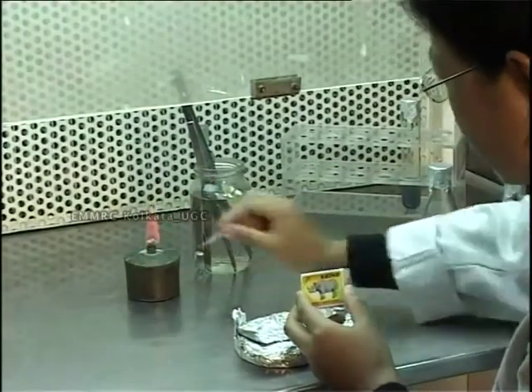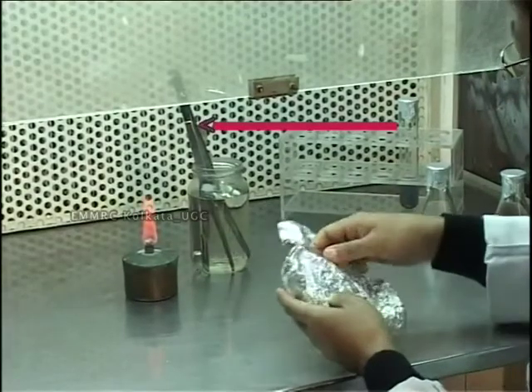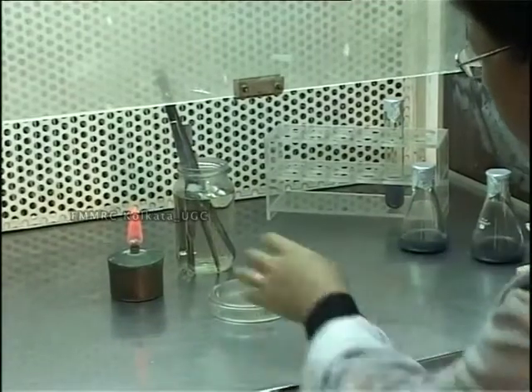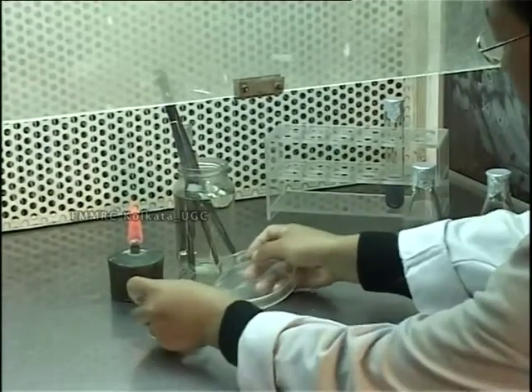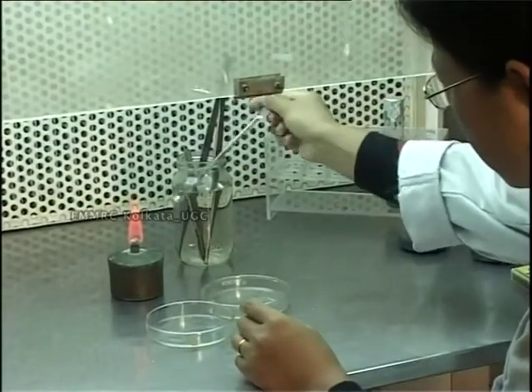This is a spirit lamp, and these instruments are soaked in alcohol. Sometimes the alcohol might catch fire, but do not panic. Just cover the bottle with a lid. That will extinguish the fire.